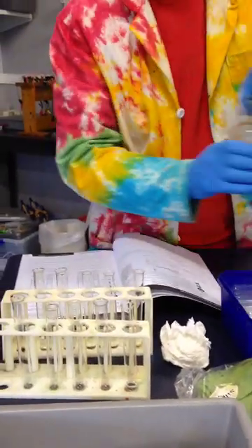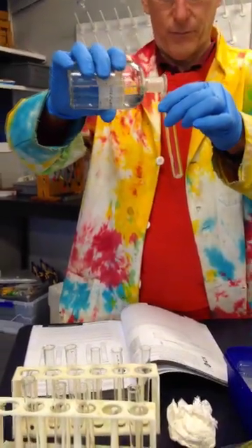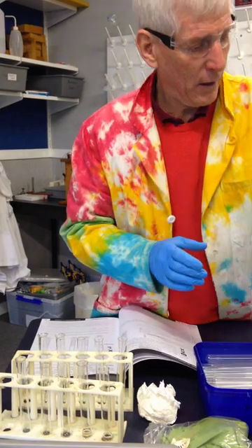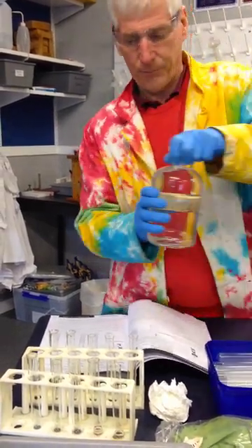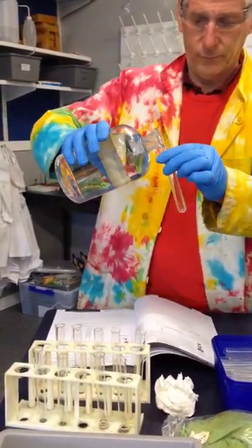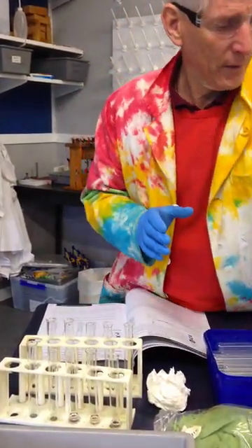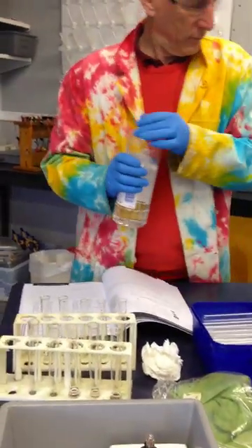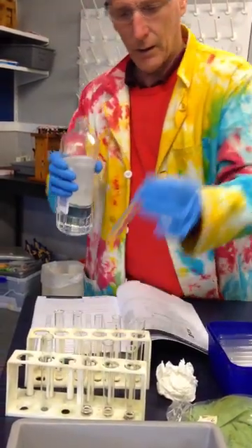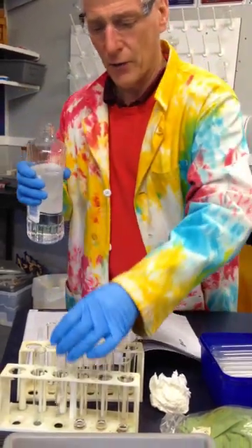So ethanol, methanol, ethanoic acid, turpentine, and we've seen the water already with the hexane, so I won't redo that one.